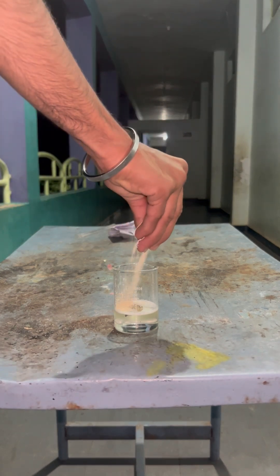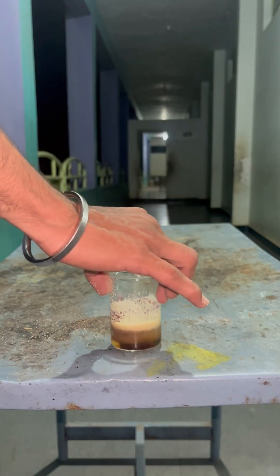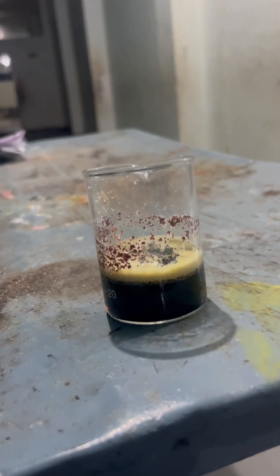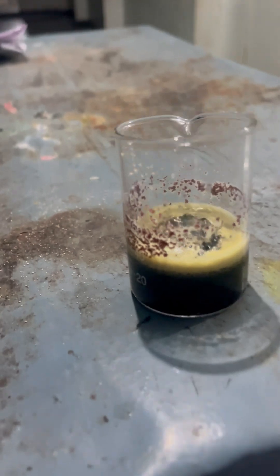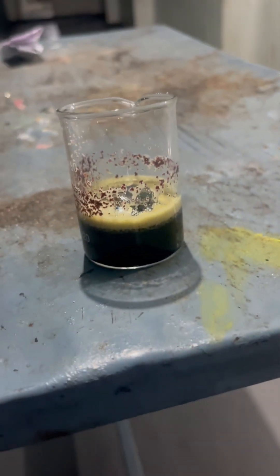Now we are adding yeast into the piranha solution. As we add the yeast, it is also dissolving and turning to a black color. You can see the final result — it turns completely dark black as the yeast dissolves into the piranha solution. Do not attempt this without proper training; you can see the condition of the yeast.